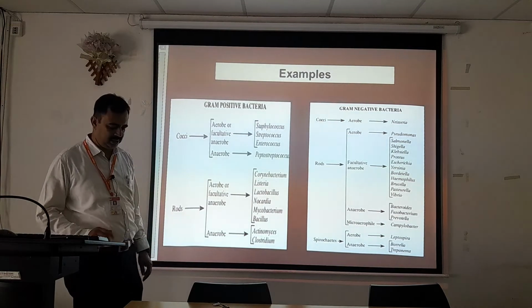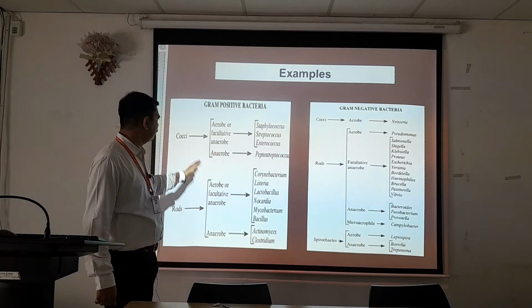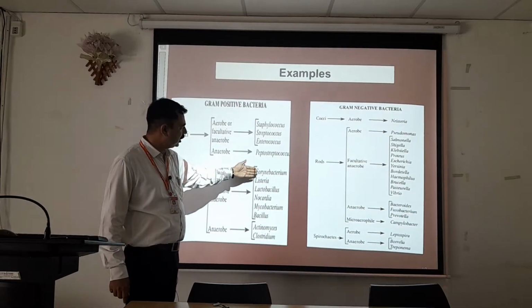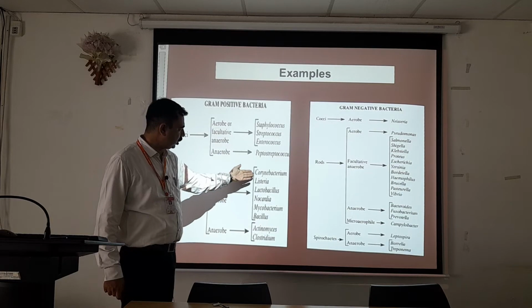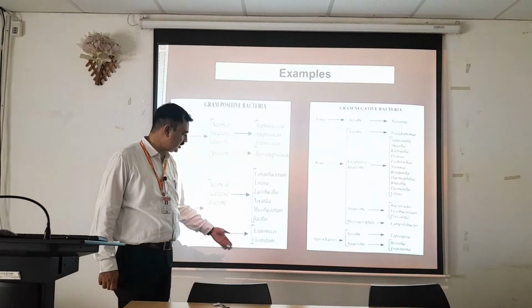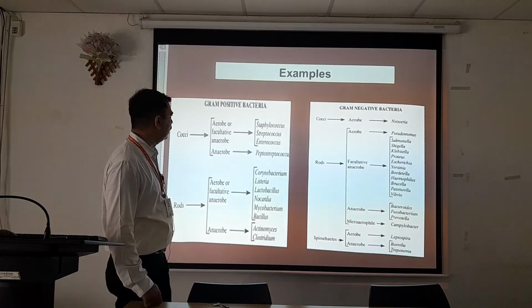Some examples. ये बहुत important slide है. Importance of the gram positive bacteria. You can see the cocci and the rods. Staphylococci, Streptococci, Enterococcus, Peptostreptococcus, Corynebacterium, Listeria, Lactobacillus, Nocardia, Mycobacterium, Bacillus, Actinomycetes, and Clostridium. These bacteria are all said to be gram positive bacteria.